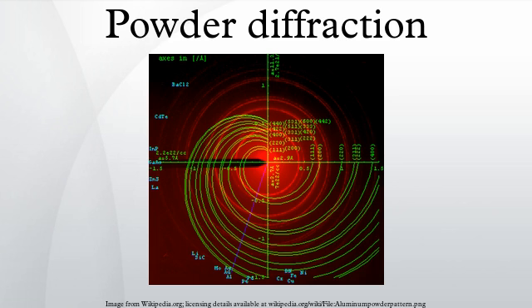Today it is represented by the Powder Diffraction File of the International Centre for Diffraction Data. This has been made searchable by computer through the work of global software developers and equipment manufacturers. There are now over 550,000 reference materials in the 2006 Powder Diffraction File databases, and these databases are interfaced to a wide variety of diffraction analysis software and distributed globally.